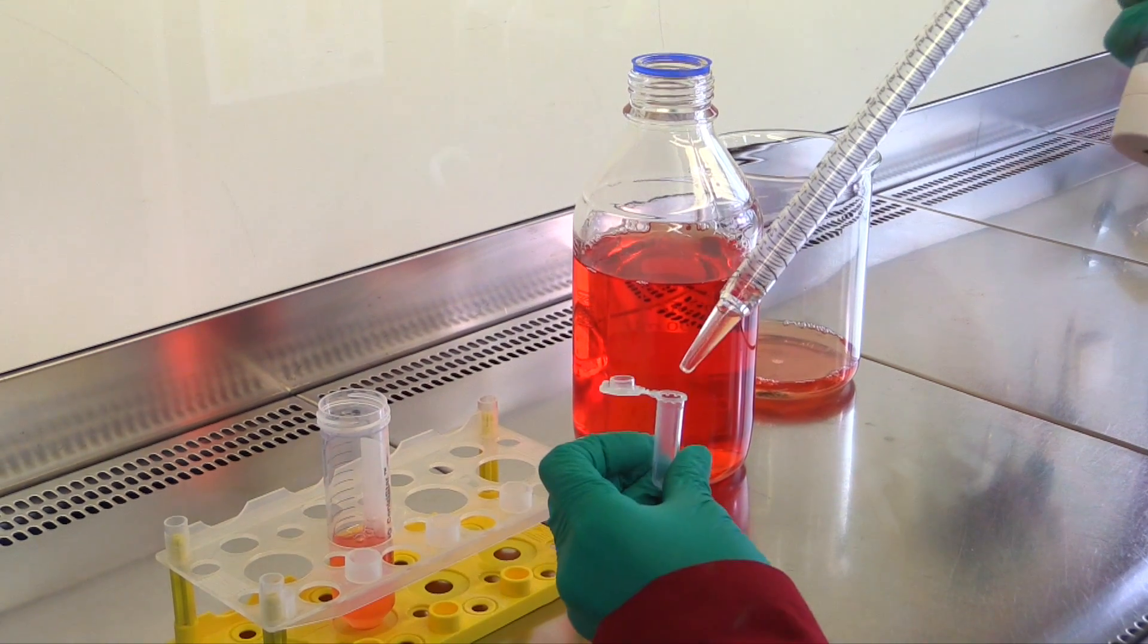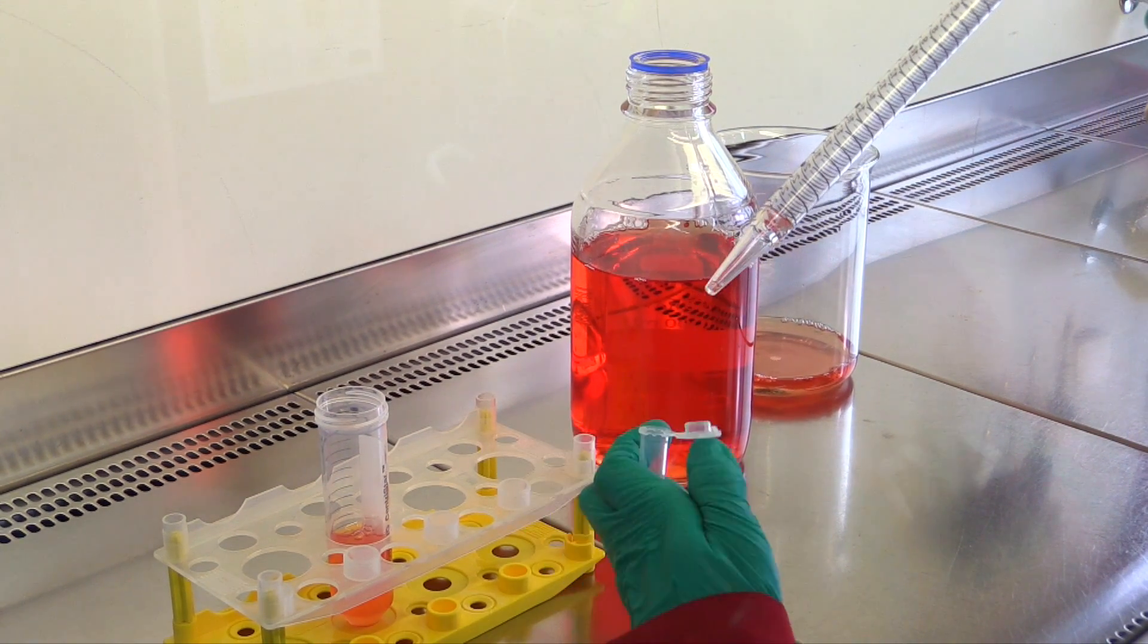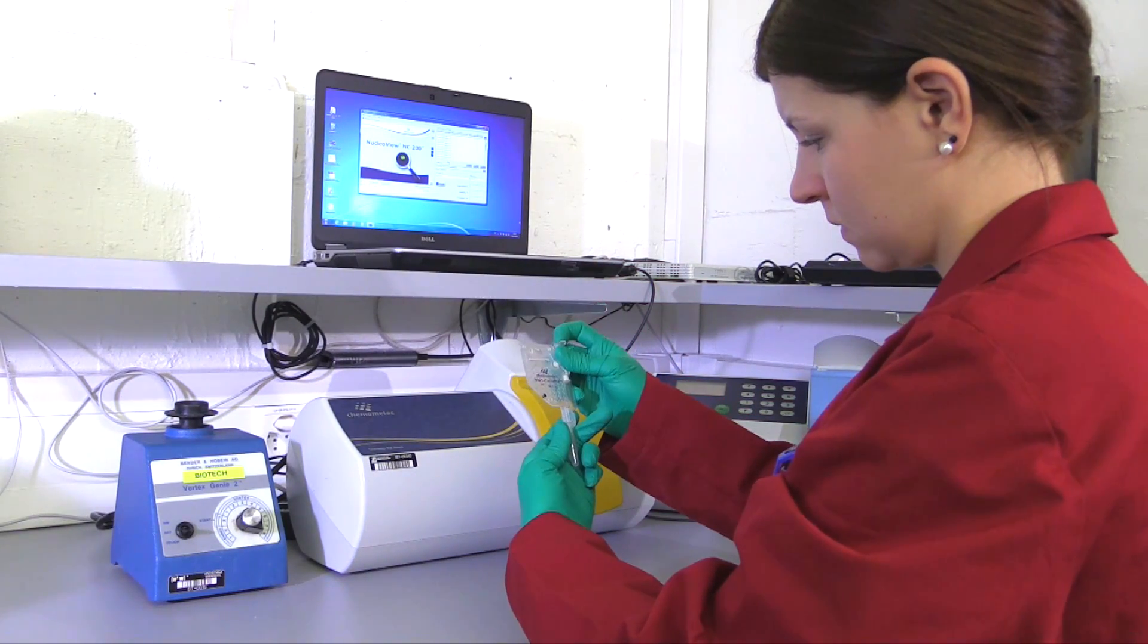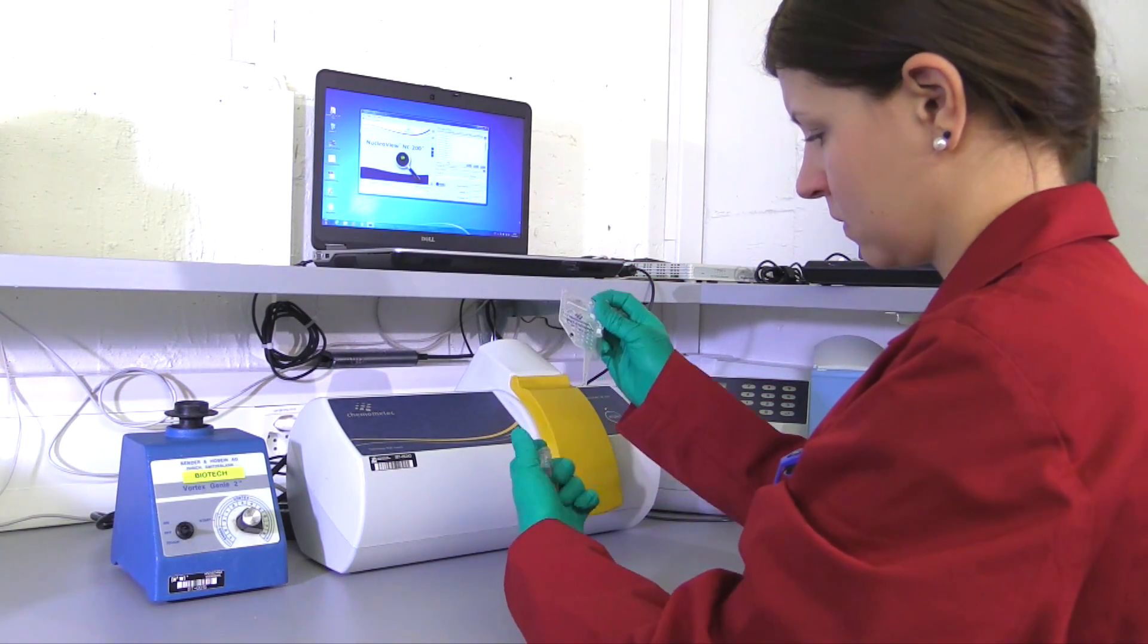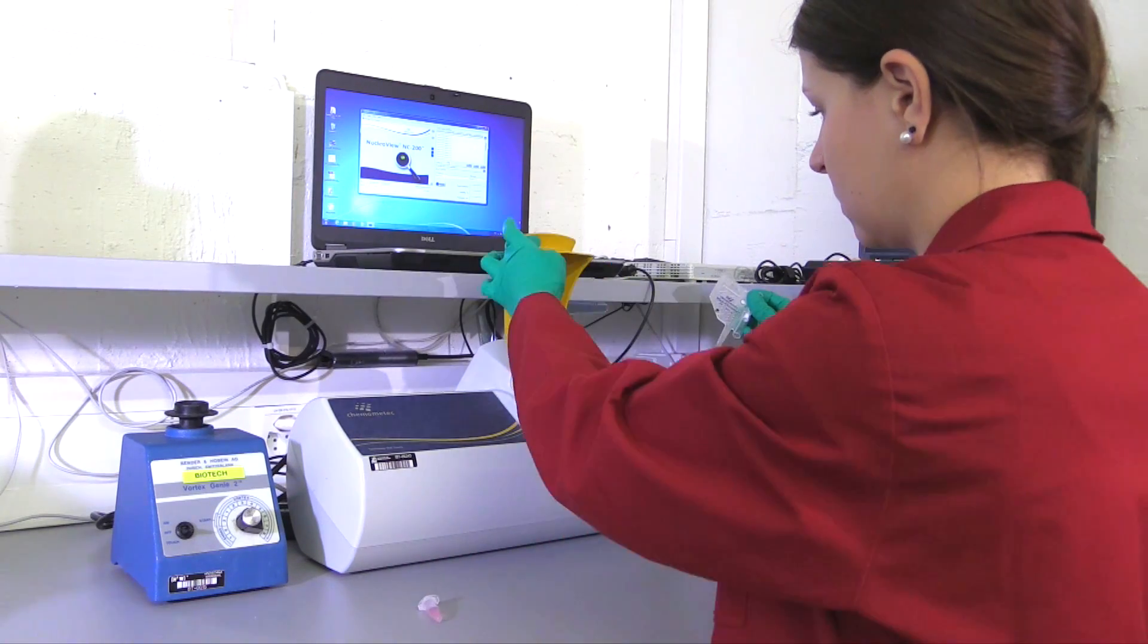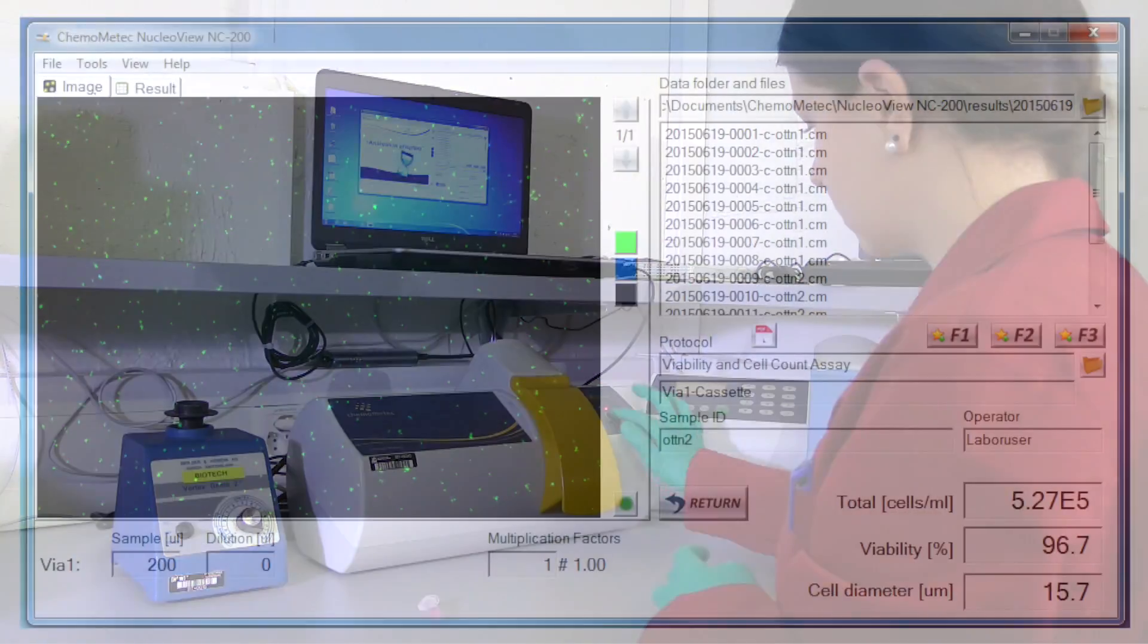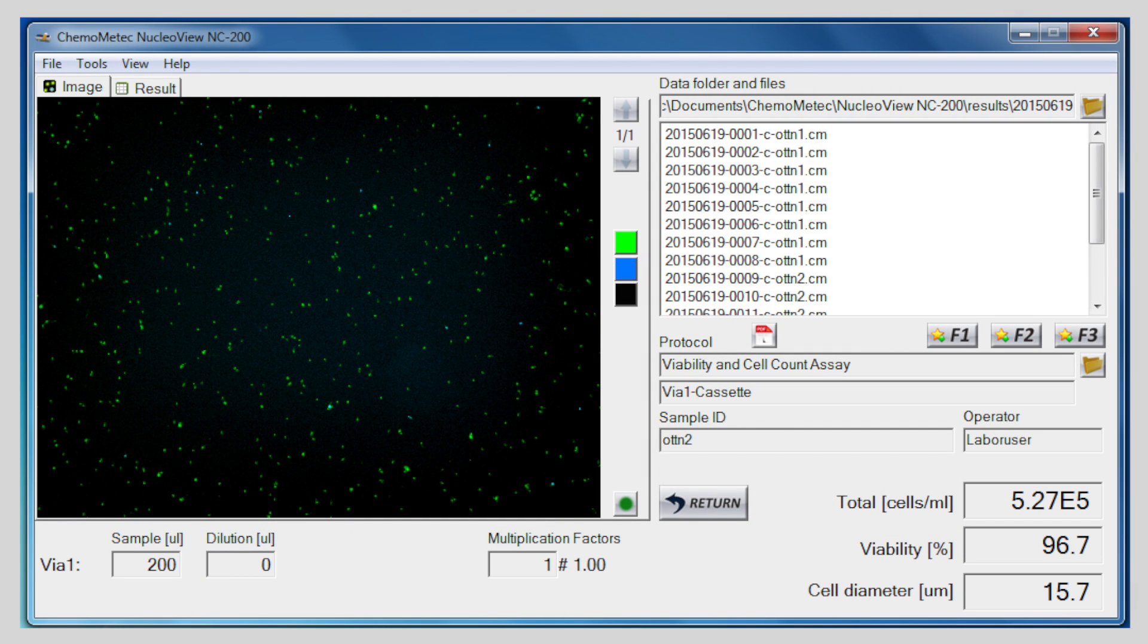Density and viability are determined using the cell-counting device Nucleocounter. Inoculation volume is also calculated. It is essential to have around 3 times 10 to the power of 3 cells per square centimeter of carrier surface and cell viability above 95% to achieve the cell growth target.